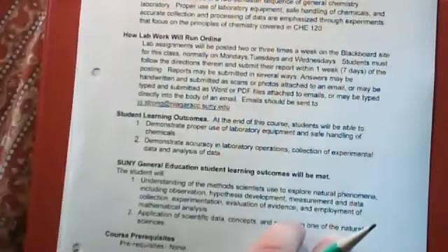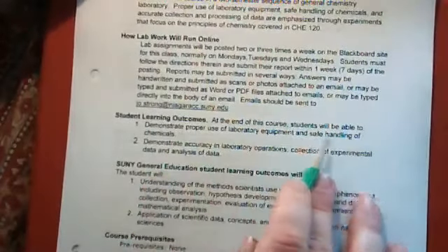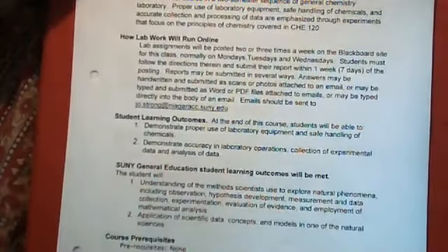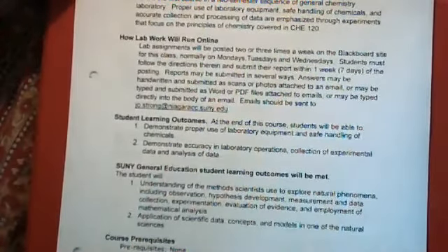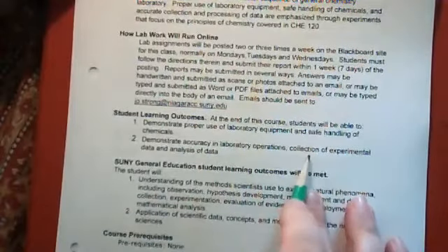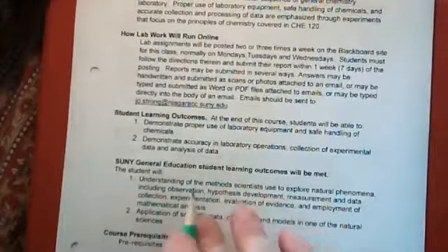Some of the student learning outcomes, what you're going to learn in this lab, we're hoping, would be being able to demonstrate the proper use of laboratory equipment and safe handling of chemicals, or at least knowledge about the proper use and safe handling of chemicals, and demonstrate accuracy in laboratory operations, that is, how to collect good data, how to do accurate calculations with those data, and that kind of thing.